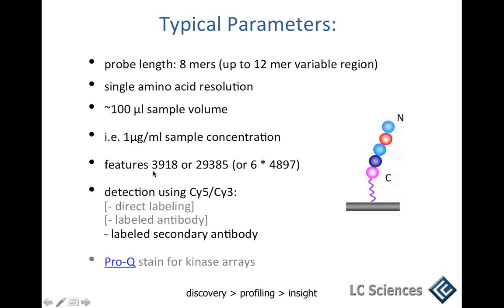The way this works is basically we fill up the chip with the sequences and the tiling that the customer designs and the number of repeats they ask us for, but then we just fill up the chip with additional repeats until it's full.